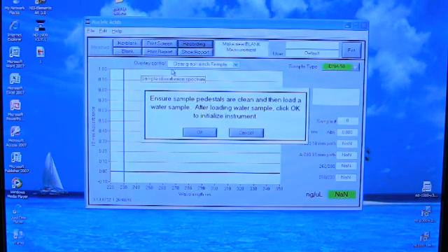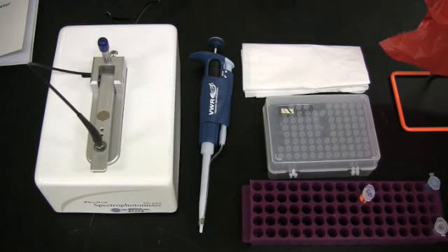At this point, the Nanodrop is ready to be prepped. First, ensure that all procedural materials are gathered. This would include a P2 pipette and adequate tips, a vial of distilled water, laboratory wipes, and a waste receptacle. In addition, prepare a small aliquot of the DNA you are sampling. A volume of 25 µL should be sufficient.